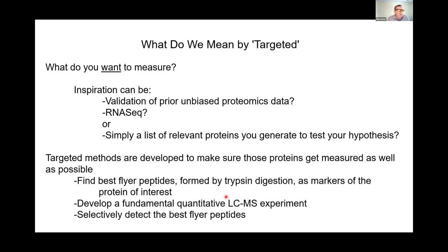And so the first question is what do we mean by targeted? There's a question today about Western blot, and it's somewhat analogous to that, where people come to us with the idea of what they want to measure. The unbiased experiments that Dennis and Rick and Sam and Karen have been talking about are the opposite of that. These are completely biased, in that we go in and try to measure the things that you ask us to measure.